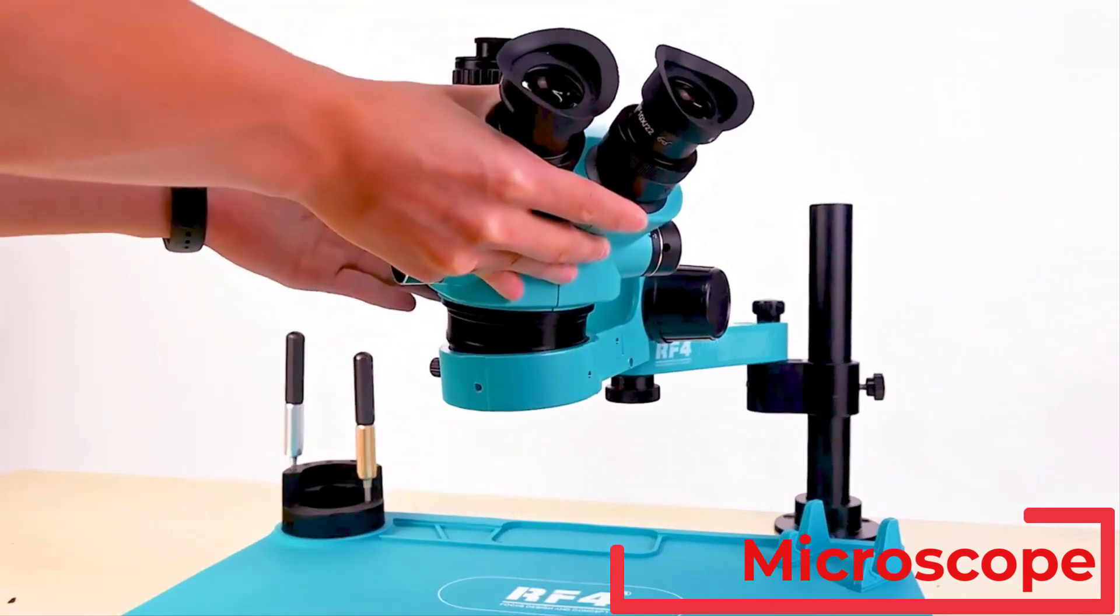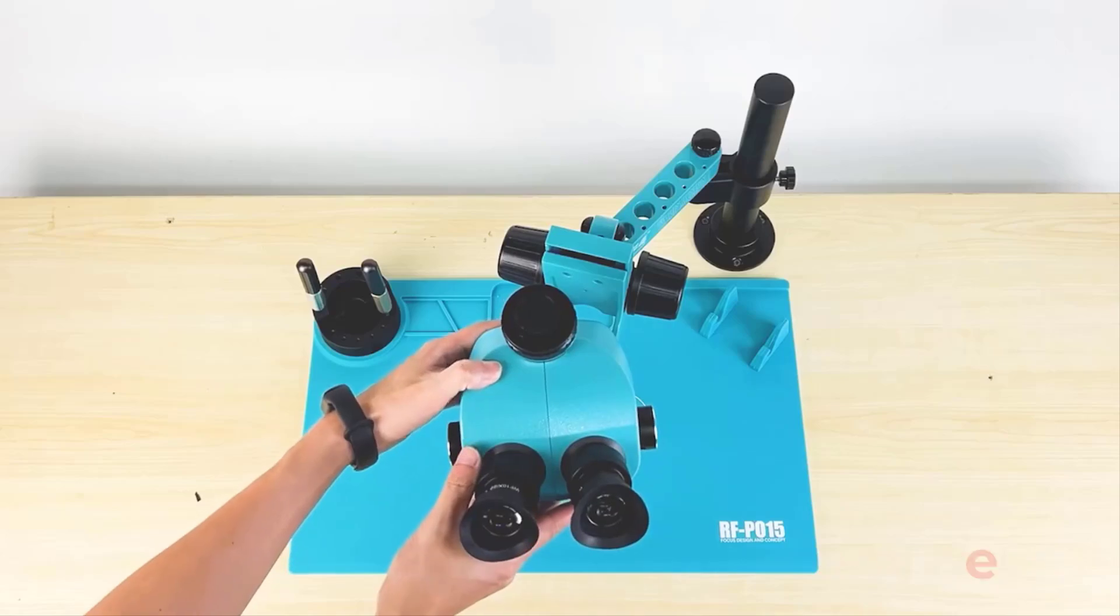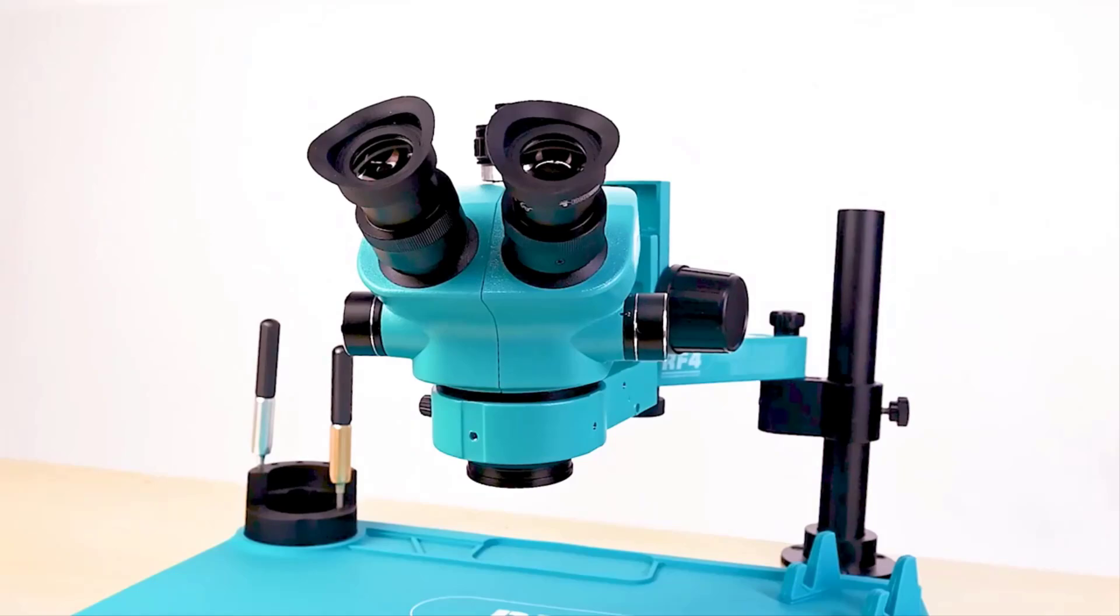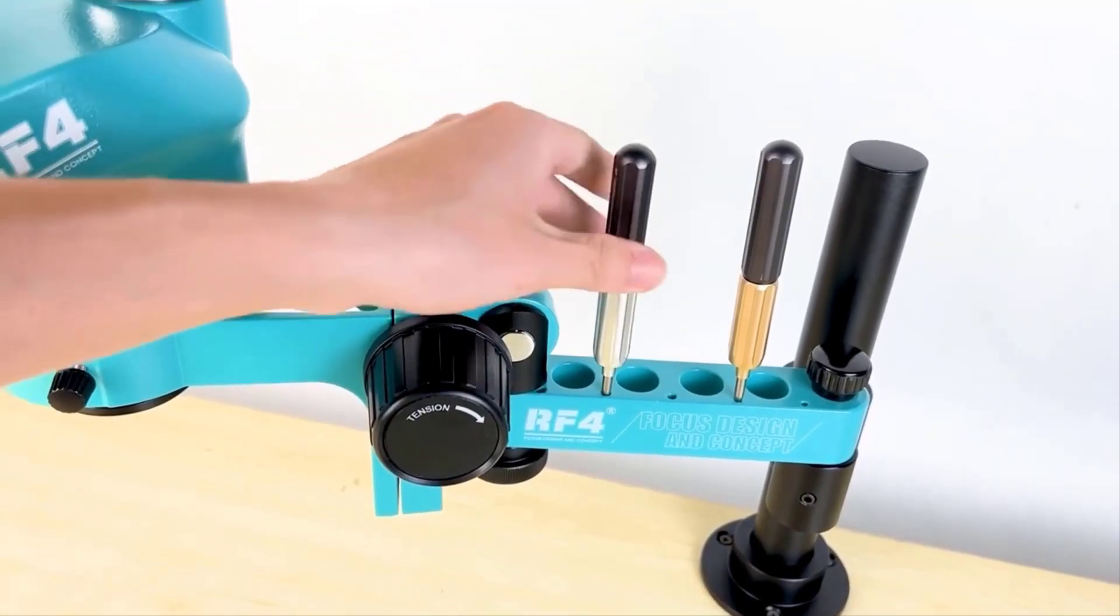We'll dive into the details of each model, examining their features, performance, and what makes them stand out. Whether you're a student, a professional, or a hobbyist, let's dive in.